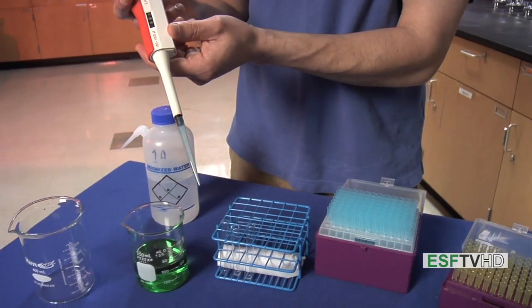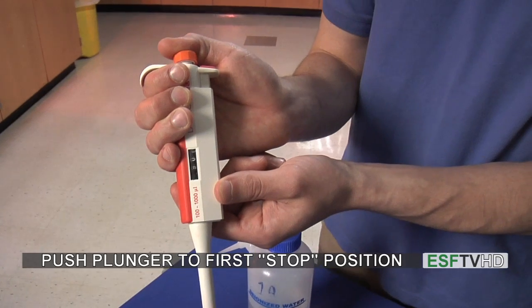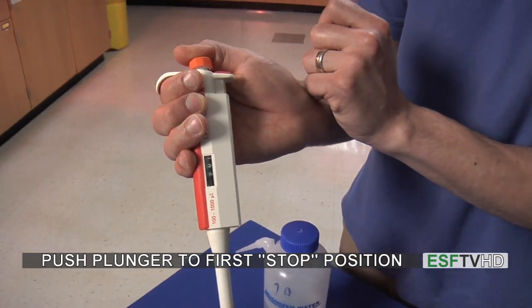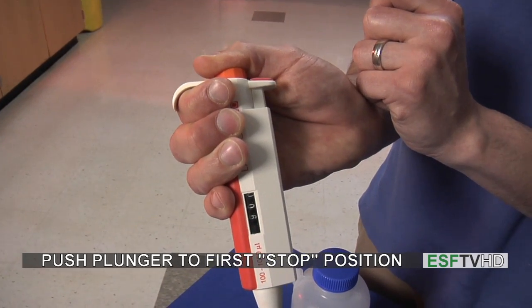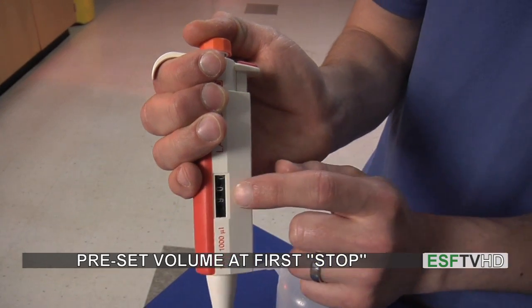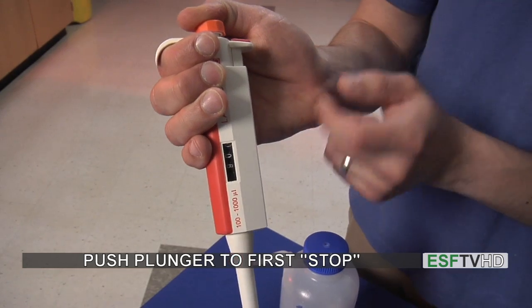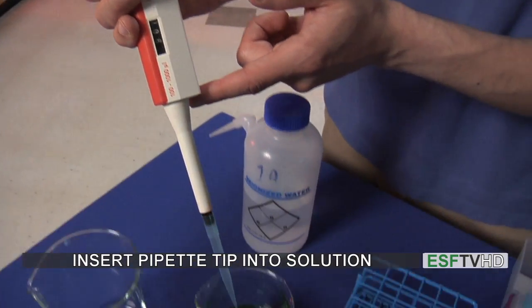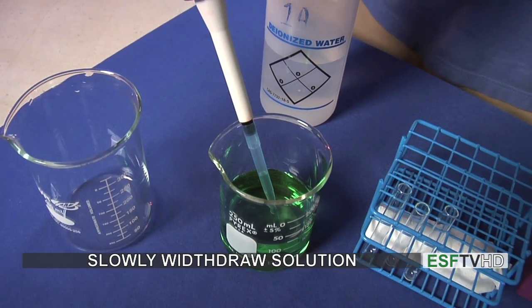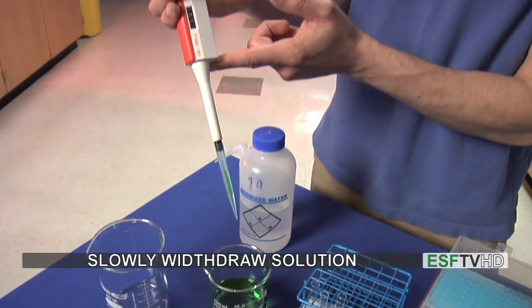I'm going to move over to my solution and push down on the plunger. When I push down on the plunger, it has two stops: the first stop, where there's about an eighth of an inch of space, and a second stop which brings it all the way down to the bottom. When withdrawing solution, the proper volume — 900 microliters — is at the first stop. So I push down with my thumb to the first stop, insert it into the solution, and then slowly withdraw. We don't want to let the plunger go — we want to slowly withdraw. And that is our 900 microliters of solution.